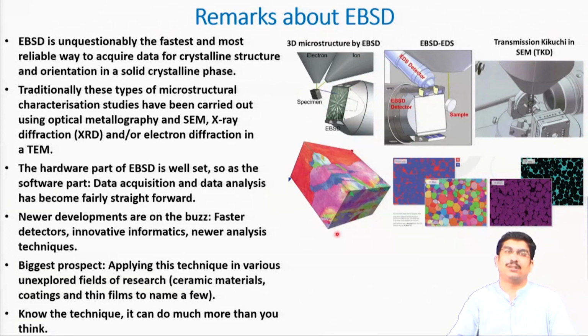We are using this in something like glass ceramics, and coatings, thin films, microelectronics; many people I have seen using this to know the texture of thin films. And this is my final remark to everyone who is listening to this NPTEL lecture: the EBSD technique can do much more than what you think.